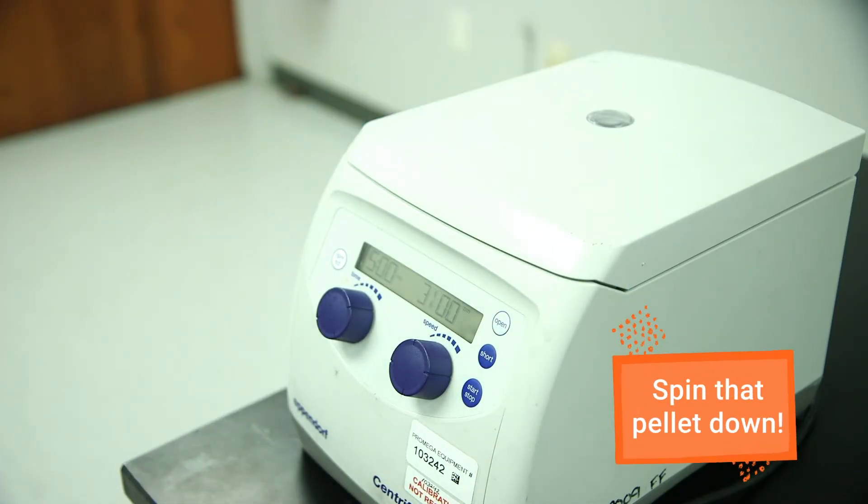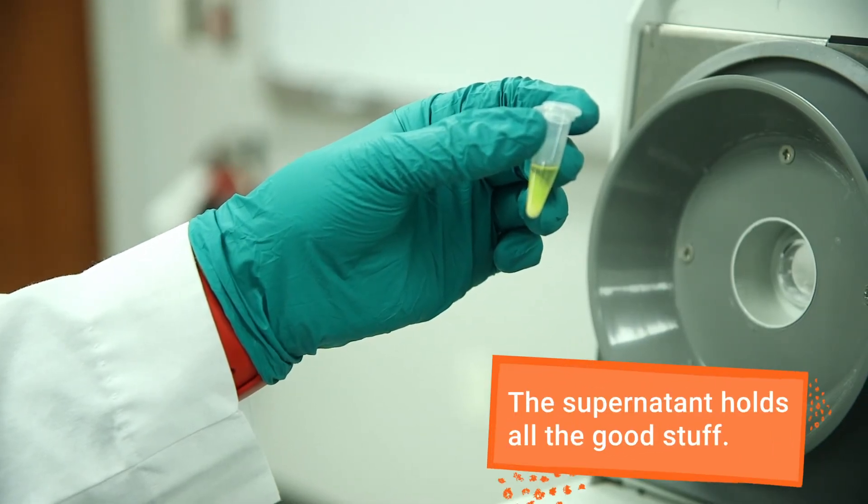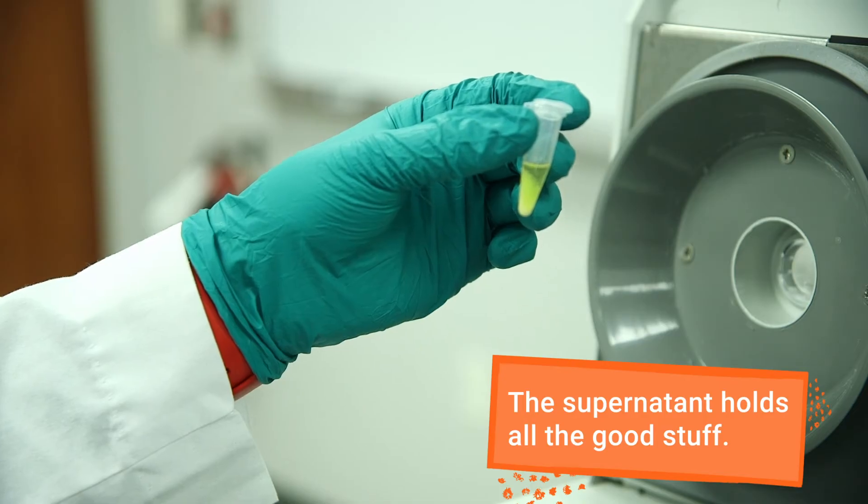Centrifuge the sample again. The pellet will contain the proteins and genomic DNA, so you'll want to transfer the supernatant, which contains your plasmid in solution, to a new tube.